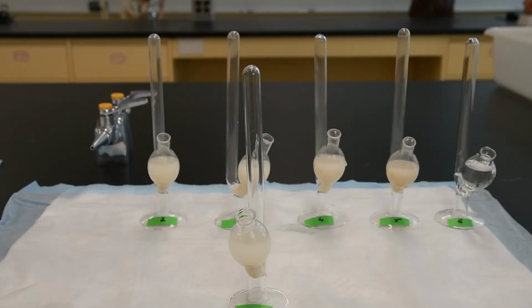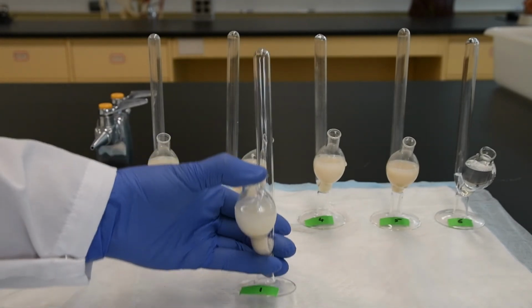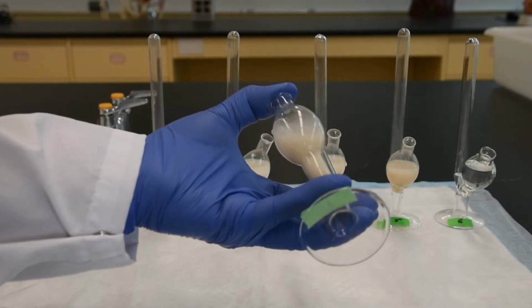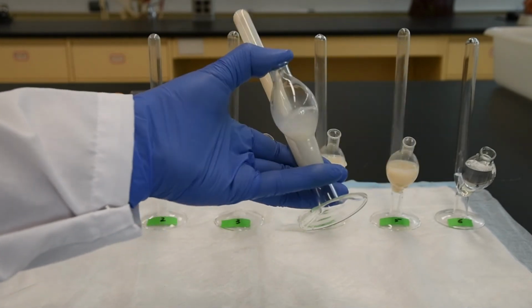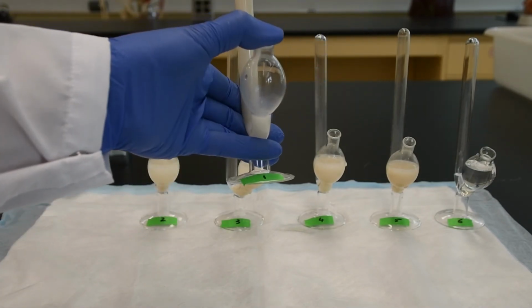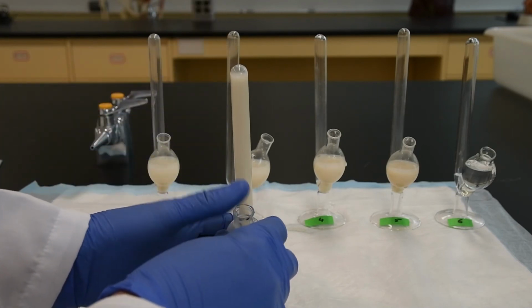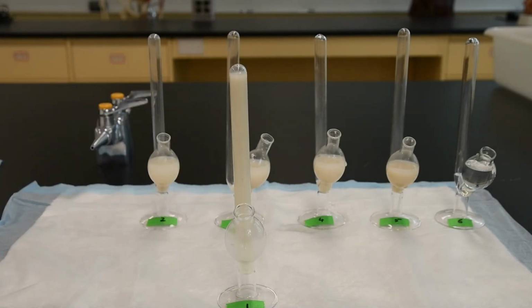Okay, so the tubes are filled with all the different ingredients. Now it's time to get the mixture up into the tail of the tube, and you simply just tip it like this. You see that it starts to form bubbles. Eventually, all goes up into the top of the tube like that. So I'm going to do that for each of them, and then I'm going to make a little mark where the bubbles started, and then we're going to get them into the water bath.